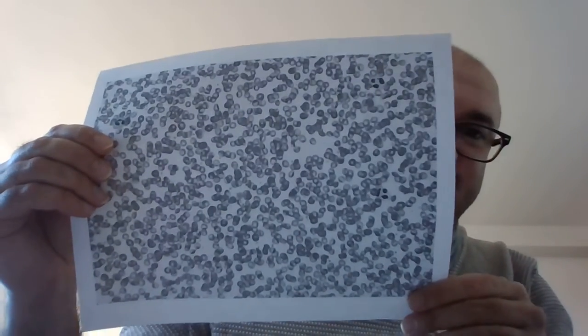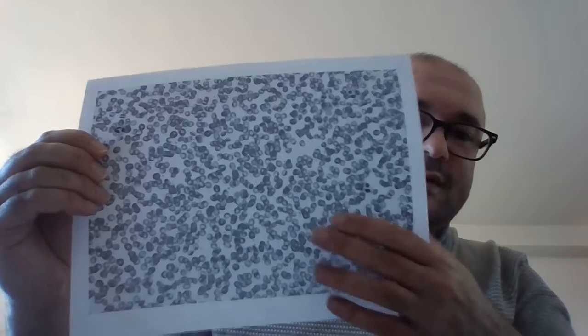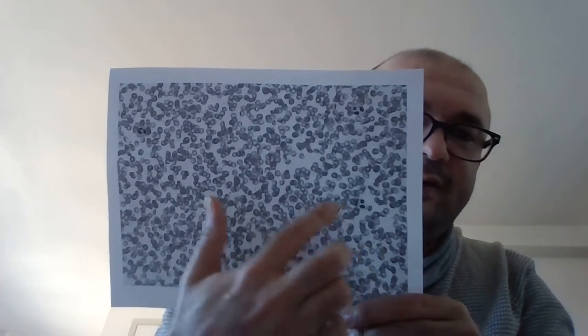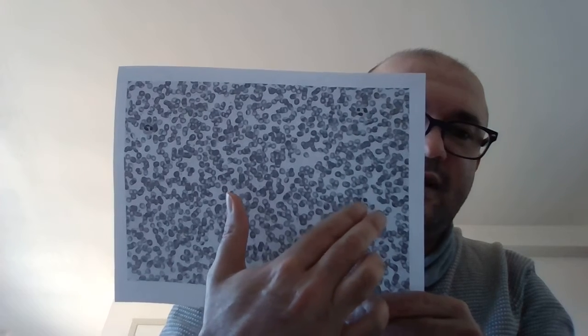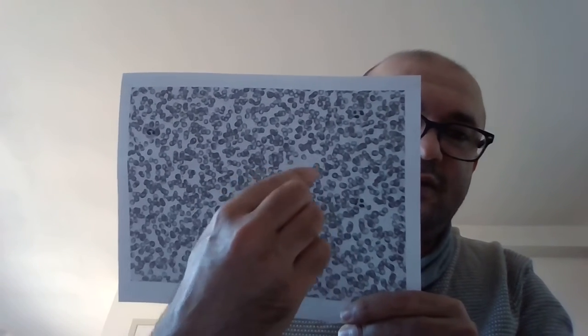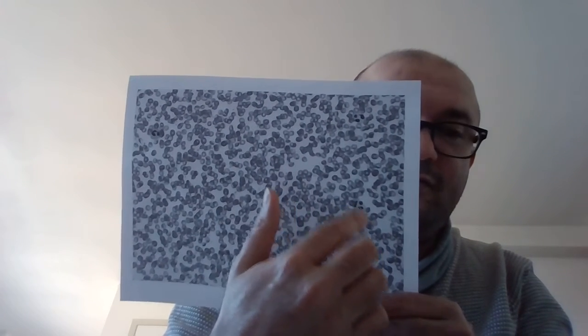lens we would see this beautiful image in a colorful version, but this one is not colorful, sorry for that. So this is a bunch of cells, the majority red blood cells, combined with nucleus-type cells, a bigger one or a smaller one like a star. This is called platelets, and lymphocytes or white blood cells.